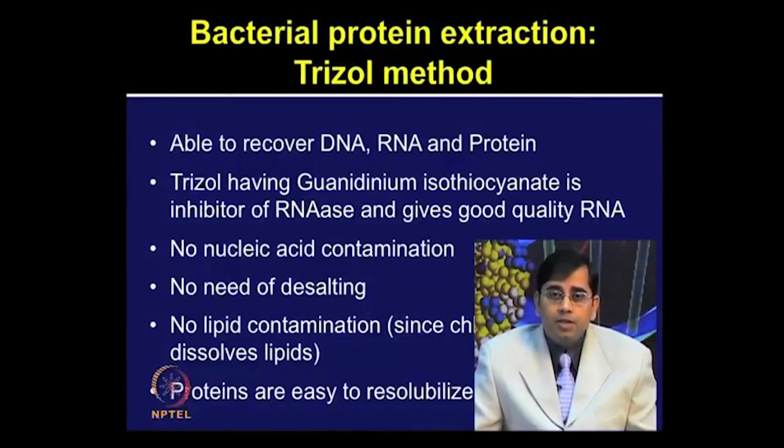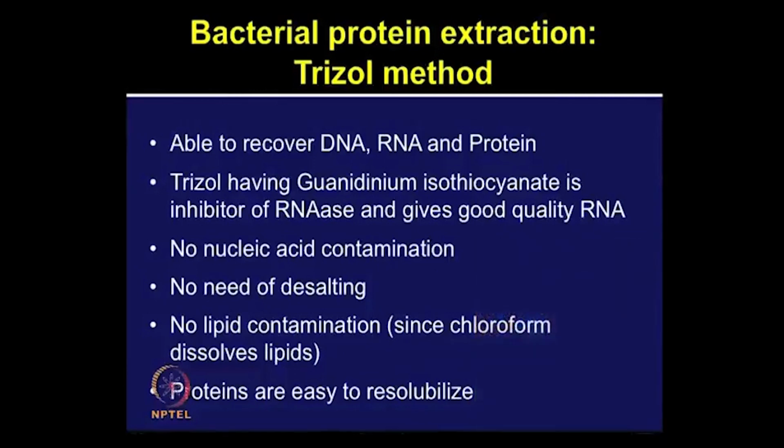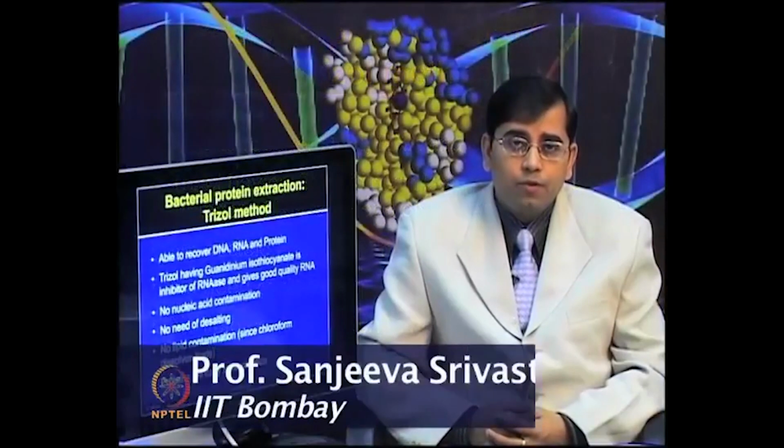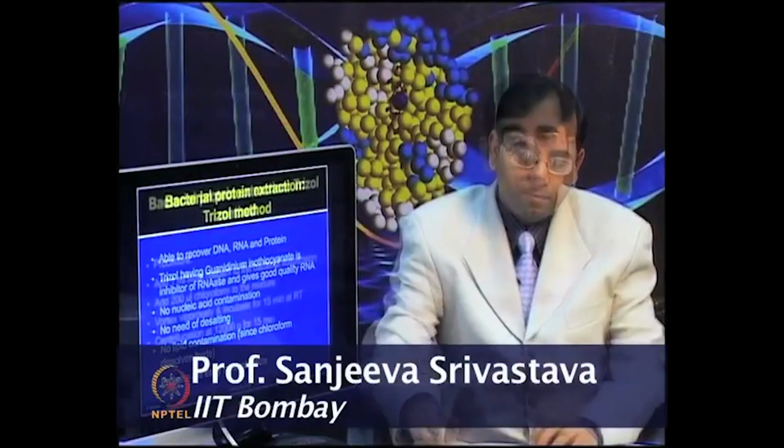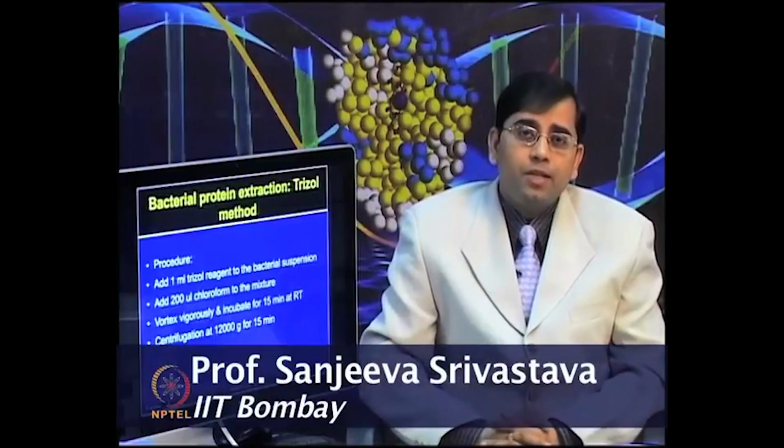There is no lipid contamination, because chloroform is used along with Trizol, which dissolves the lipids. So, this method is able to get rid of various types of interfering components as well as different types of contaminants. And finally, the proteins are easy to resolubilize after extraction from the Trizol based method. So, this method is very useful for extracting bacterial and other proteomes for analysis. Let me brief you about the procedure.